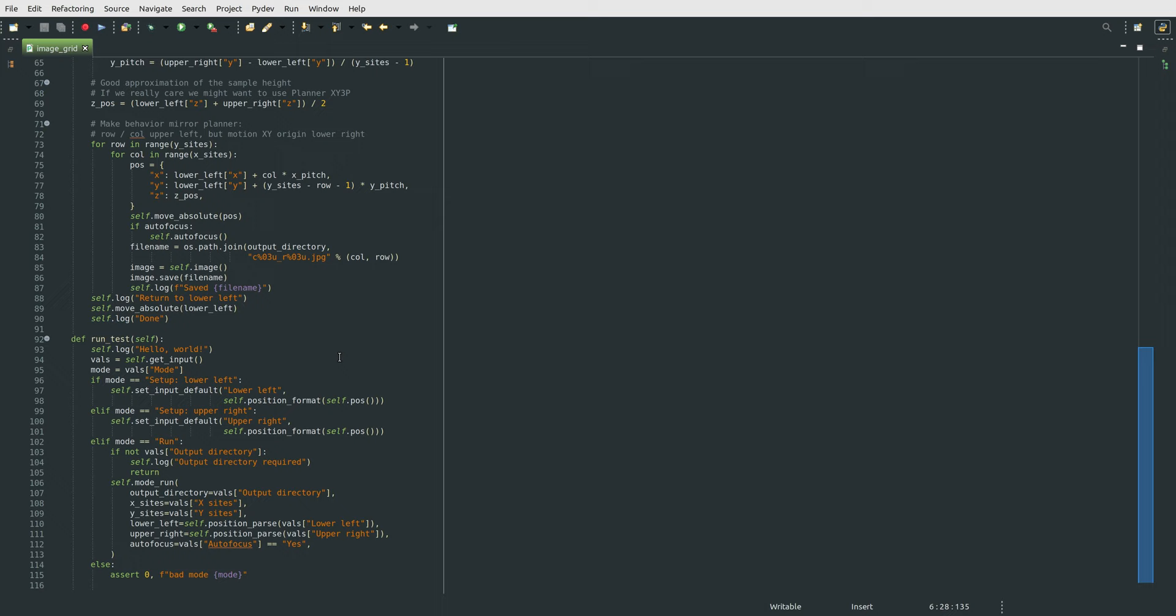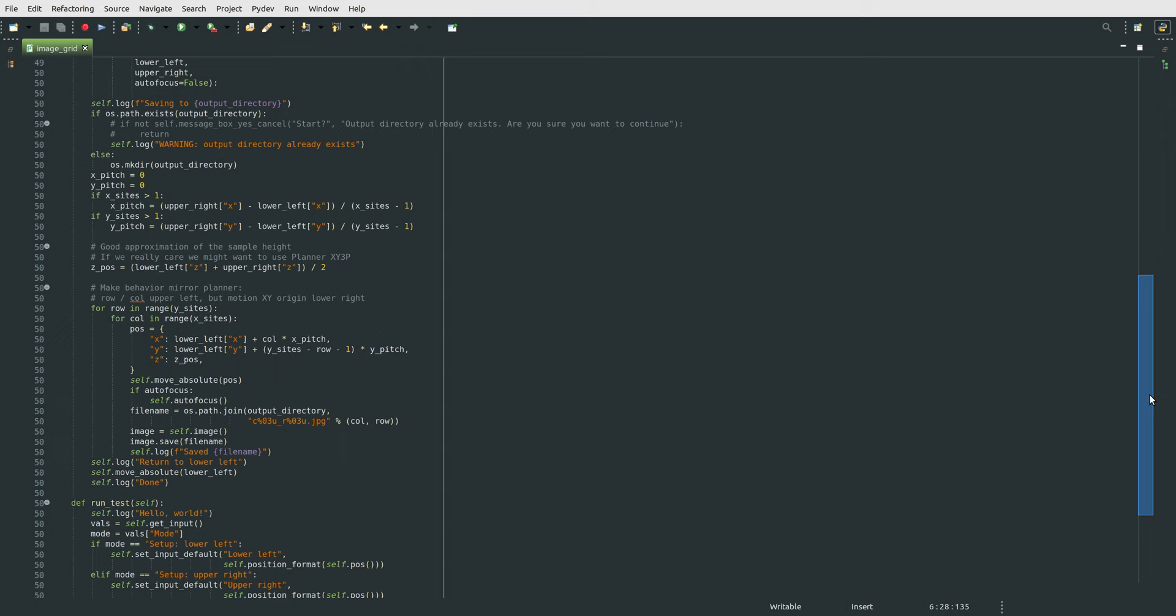we hit the run mode, parse that string version of that coordinate back to an actual Python data structure as a dictionary of coordinates, and that gets us to the real meat of this program, which is this mode run function up here.